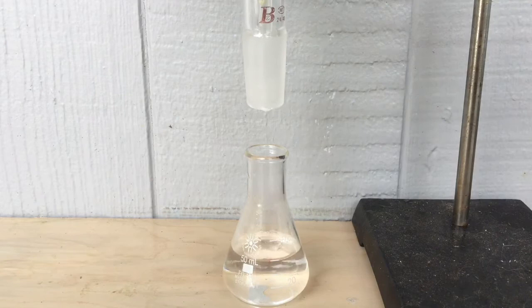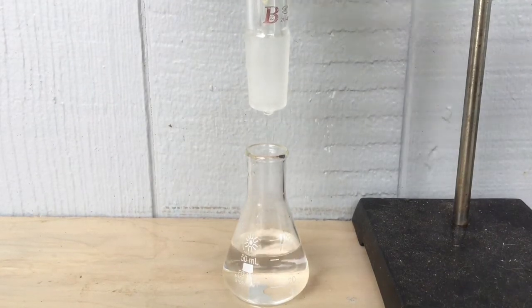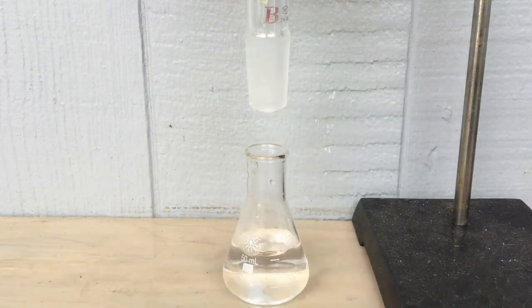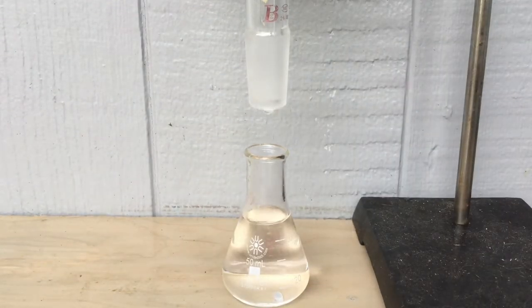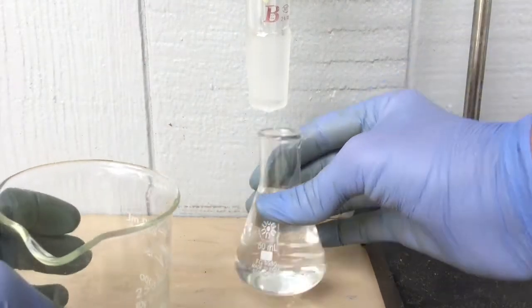It's easy as that, and I hate burettes anyway. Now you can see a little bit of pink color change, but also the flask was getting a little too full, so I transferred it to another beaker.